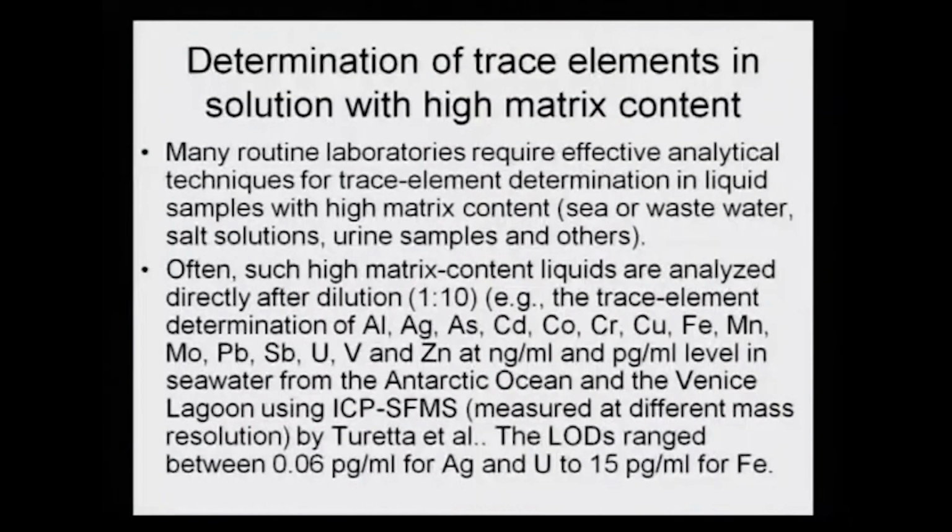Determination of trace elements in solution with high matrix content. Many routine laboratories require effective analytical techniques for trace element determination in liquid samples with high matrix content, that is seawater or wastewater, salt solutions, urine samples and others.